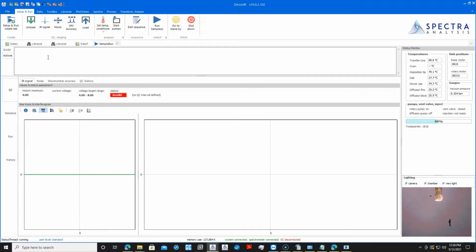Just below the ribbon there is the Actions View block. This will display the history of activities that the operator has performed. A blue background behind a button on the ribbon indicates the button is depressed. It may turn itself off upon completion or can be pressed again to abort the action or procedure. Most buttons are mutually exclusive and cannot be turned on until the previous button has turned off.